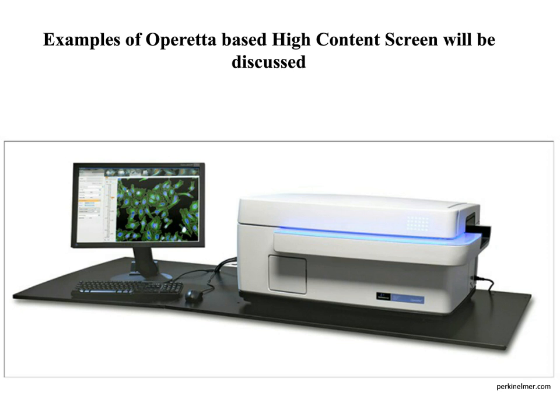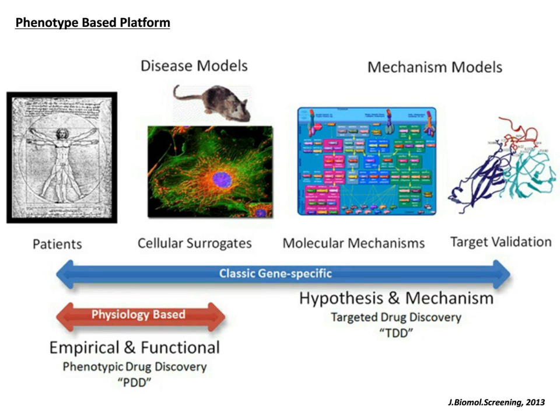So if you look at drug discovery, one can broadly classify it as a target-based drug discovery or a phenotypic drug discovery platform. And phenotypic drug discovery is not a new concept, but it has recent improvements with high-content imaging systems for producing high-quality images have aided or have allowed for this approach to be effectively used.